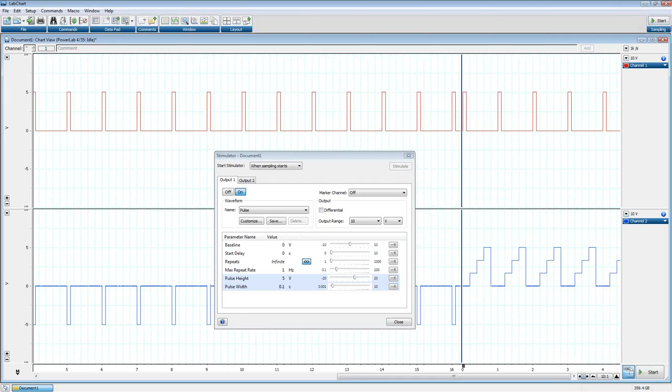As for which PowerLabs can do this, currently it's only the research series and some of the previous research series. So the 35 series, the 30 series, and the SP can do this. Off the top of my head, I don't believe the 26 series can, but most of the teaching PowerLabs cannot. They're just going to be locked in that differential mode. This is kind of a hardware option as well as a software option. The research PowerLabs have that additional hardware that's required in there.